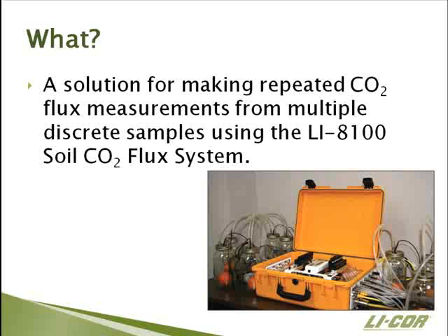And this allows you to explore both temporal and spatial variation. So within the system, there's a multiplexer that'll let you connect up to 16 chambers to it at once. And so you can look at temporal variation by making repeated measurements with the system, and you can look at spatial variation by making measurements across a landscape.